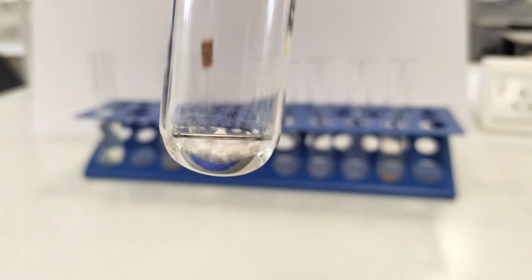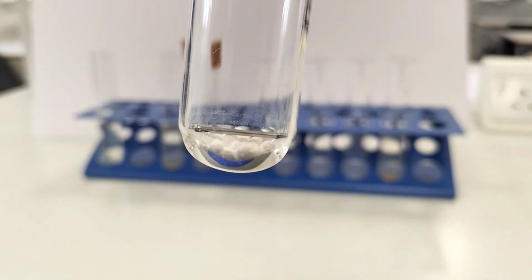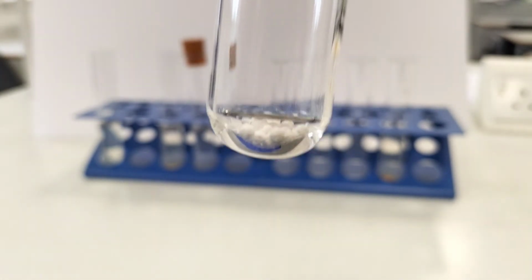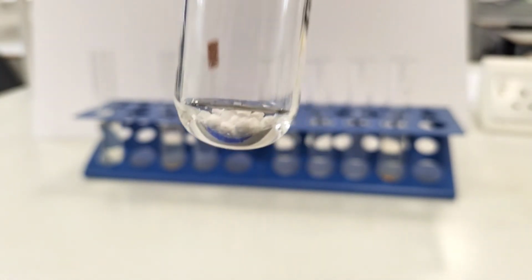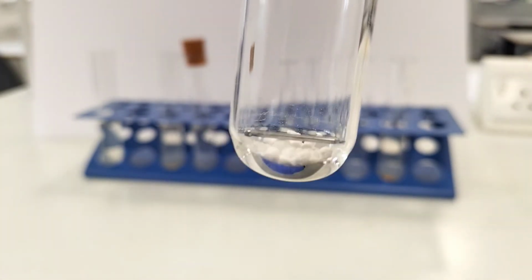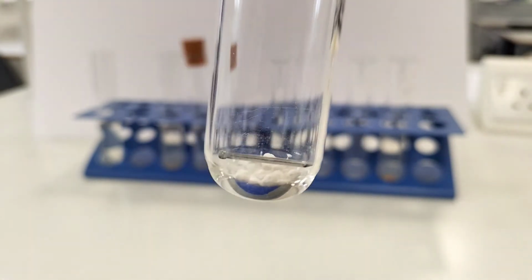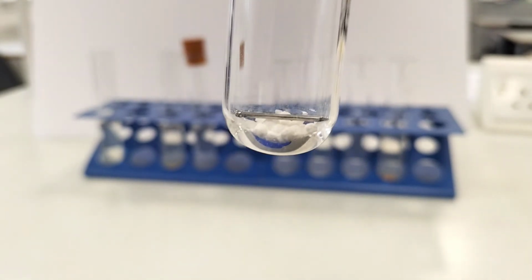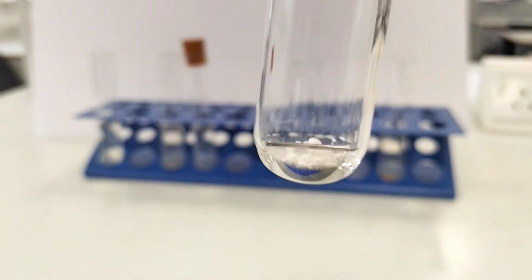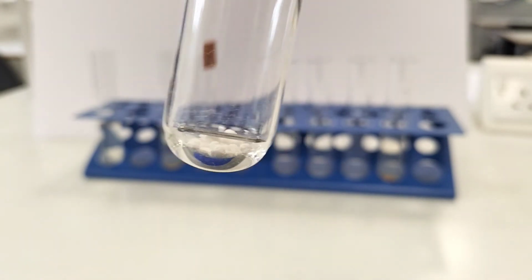Okay, so experiment 4, that nail looks as fresh as the day we placed it into this boiling tube. So the drying agent below the nail, that anhydrous calcium chloride, has removed one of the key necessary substances for rusting to occur. It's continuously been removing moisture, water, from the air around the nail, so it's not in contact with water, only oxygen, and that is not sufficient for rusting to occur. So for rusting to occur, we need the iron nail to be in contact with both oxygen and water. This experiment has removed the water, and so no rusting has occurred.